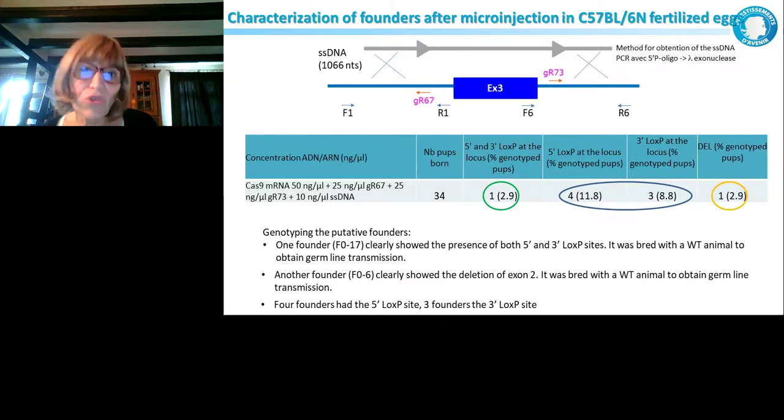And here I want to show you one project that worked pretty well in our hands. It's not really obvious, because we observed a little bit the same kind of things that were observed by all the people who tried to do conditional knockouts, but with a single-stranded donor DNA instead of 2 single-stranded oligos to insert the LoxP sites, it will work better. And that's what we obtained.